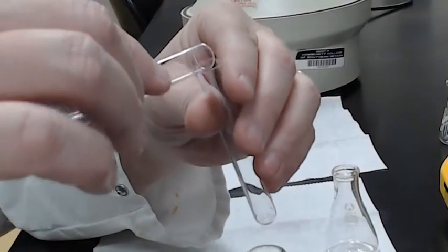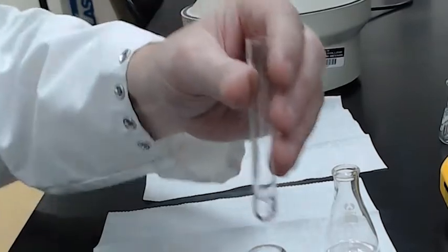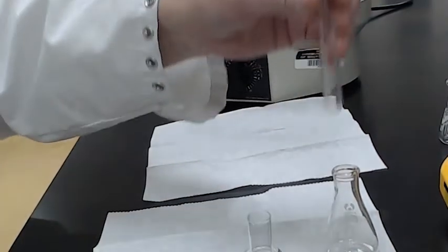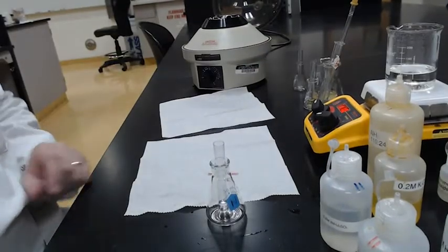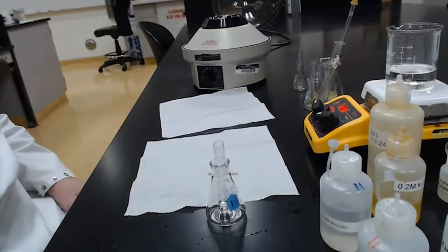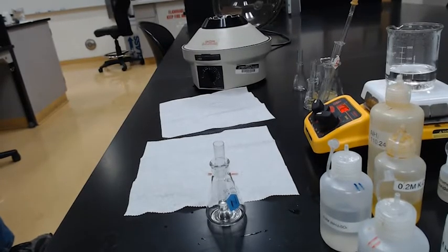Precipitate, we don't want that. We want the supernatant. So we're going to transfer all of our supernatant unknown into this test tube, and then we can move on with the magnesium test. Okay, so we have verified that we removed both the calcium and the barium.